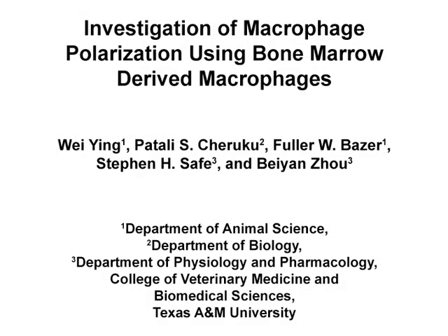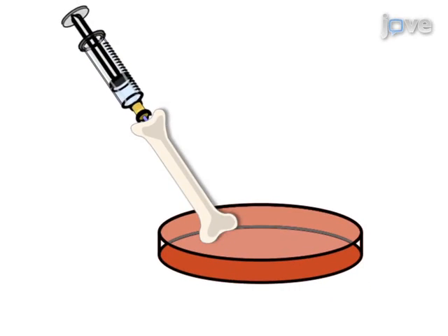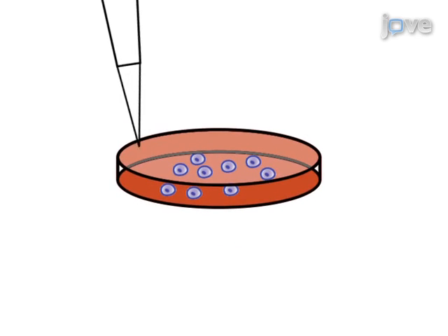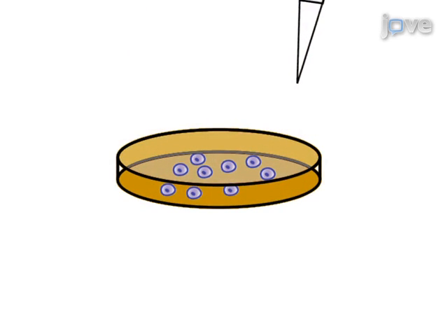To generate bone marrow derived macrophages for polarization analysis, femur and tibia bones are isolated from mice and the bone marrow cells are collected. The cells are then cultured in medium containing growth factors to induce macrophage formation.